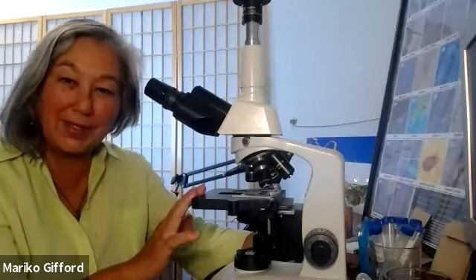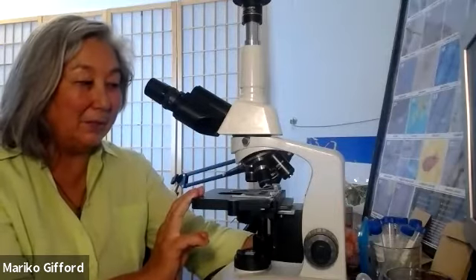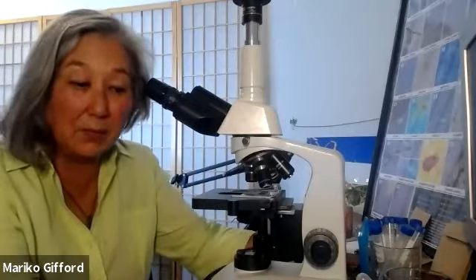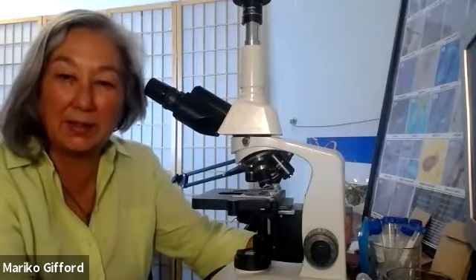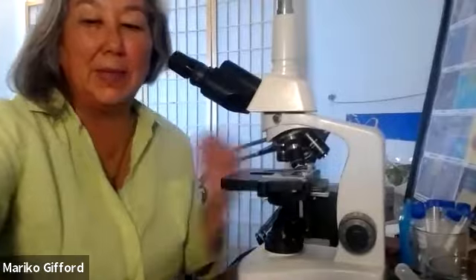Some of them are more complicated, take more training, but it's amazing as well. And others, this little small one, I just think it's so clever. And as time goes by, we'll have more and more technology that helps us out in the field. At some point, we'll be able to do some more imaging of these things, but there are good resources on the internet. You just have to really know what you're looking for. You have to go through them, because a lot of them are not soil biology ones, the soil microorganisms. So those are a little bit harder to find.